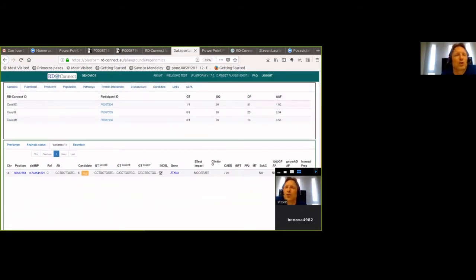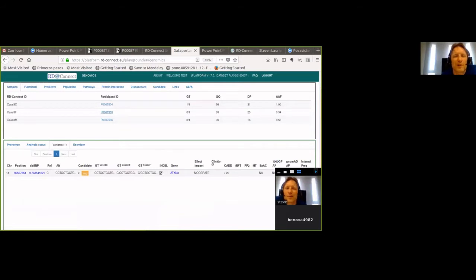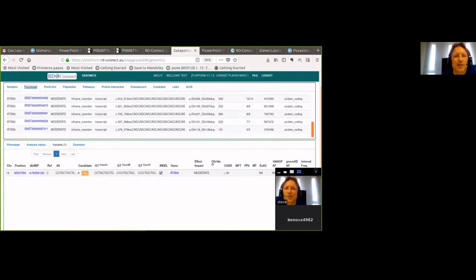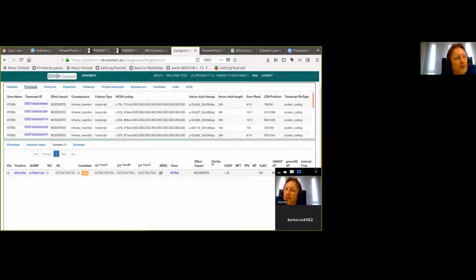In the middle panel you can look at more information about this variant. The genotype quality is 99 — the maximum — and depth ranges from 16 to 31, so it's technically a good quality variant. Looking at the effect, it's hitting multiple Ensembl transcripts and causing an in-frame insertion — a glutamine expansion adding eight extra glutamines. This may or may not be damaging. You can see all transcripts affected. Note that a variant might have high impact on a transcript that isn't expressed in the tissue of interest, so it may not be biologically significant.